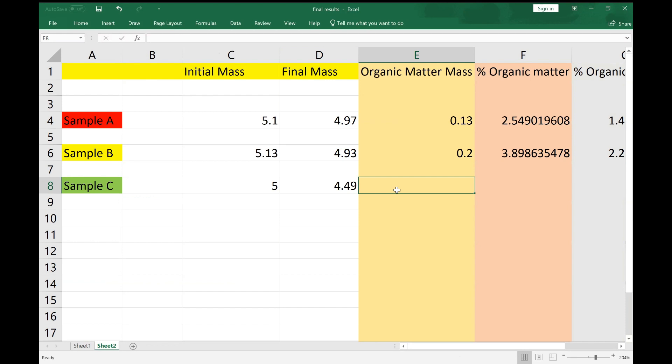And I have done that for sample A and sample B, but in sample C I'm just going to show you a couple of things that you can do in Excel if you don't have a calculator. So in Excel, just hit the equal sign and that tells Excel you're about to do some calculations. So to calculate organic matter mass, I want to subtract from C8, the initial mass, I want to subtract D8, and I just hit equal sign. Now to convert that into percentage organic matter, all I have to do is hit my equal sign again and I'm going to divide my organic matter mass—the forward slash is your division sign in Excel—by my initial mass.